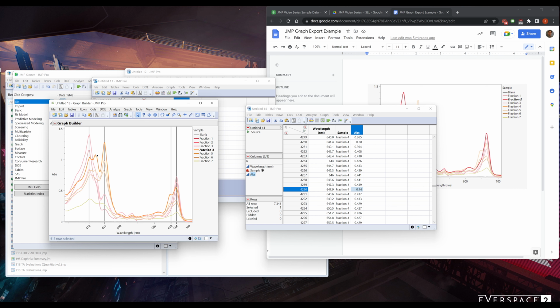So we see the pheophytin. We see this peak here. This peak is actually chlorophyll A and then chlorophyll B. So most of our pheophytin degraded. It looks like our chlorophyll A came out the tail end of it, and then we see just the gradual dilution of chlorophyll B as we run out of it in the column.